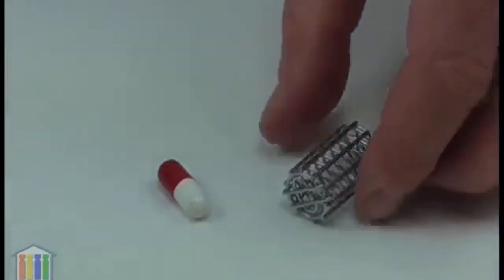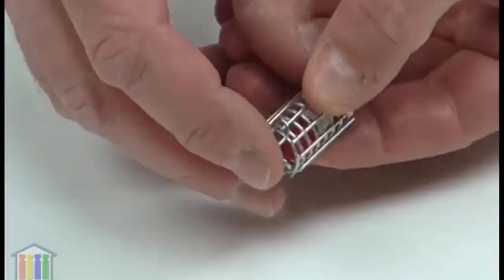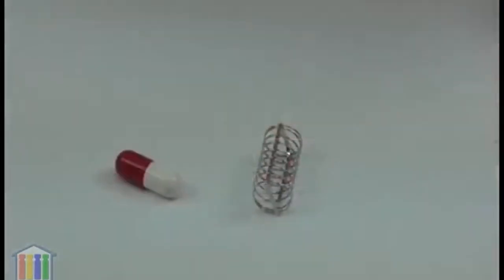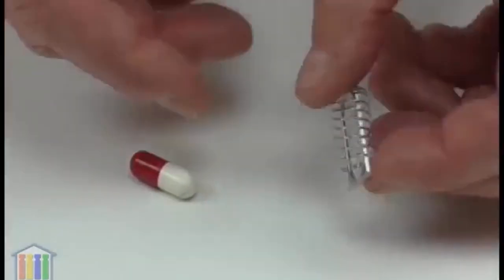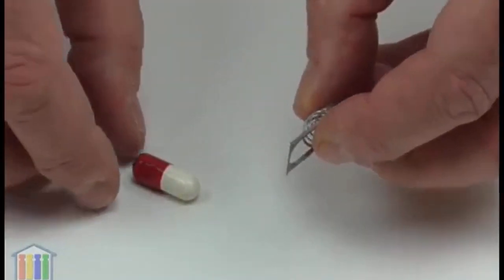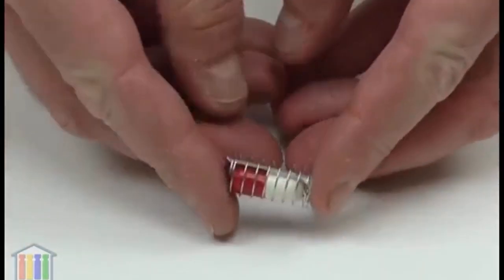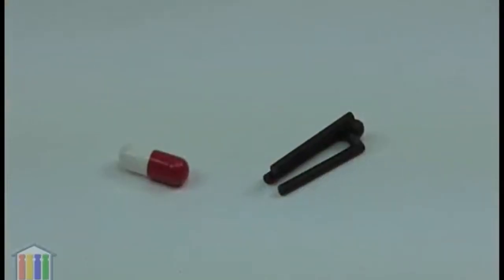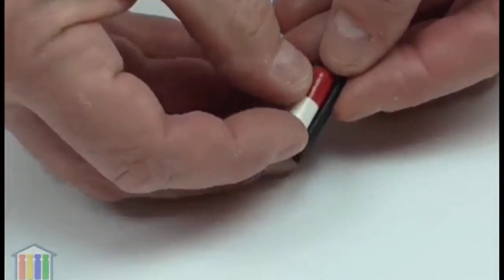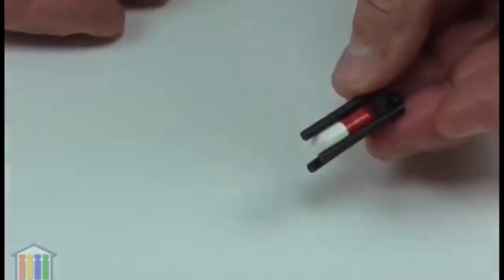The Japanese basket has a lid on the end which simply flicks open, the capsule fits inside and the lid is closed again and the capsule is held inside the sinker like so. This is the Sotak sinker. This one has a spring that pushes backwards and forwards. You can push it with your finger. Simply push the spring back, take the capsule, slips inside and the spring moves back and the capsule is inside the sinker. To use the 3-pronged sinker, simply take your capsule, align it along the capsule sinker, and push the end in with your thumb, and the capsule is aligned with the legs.